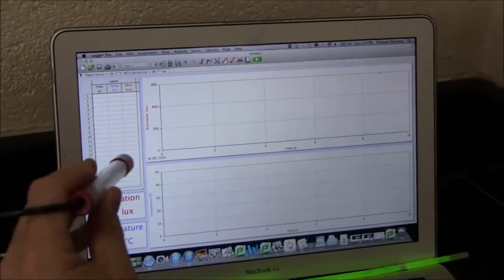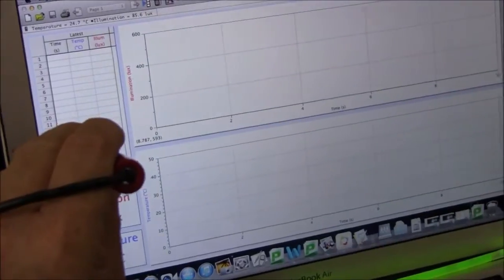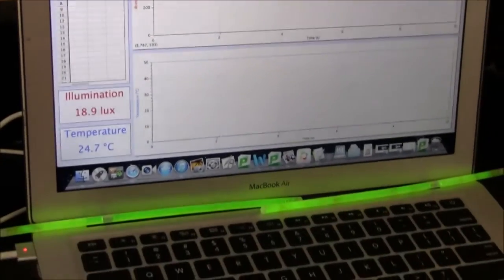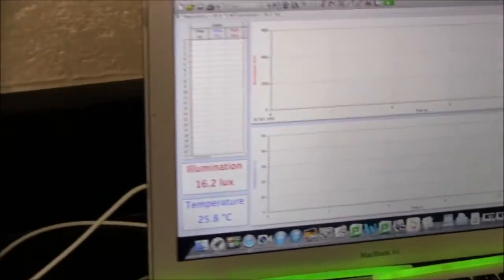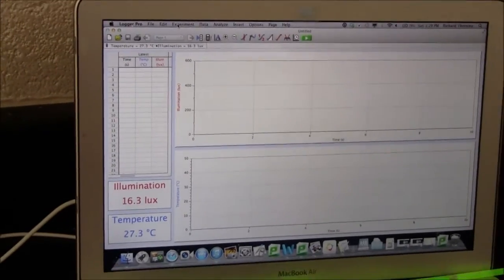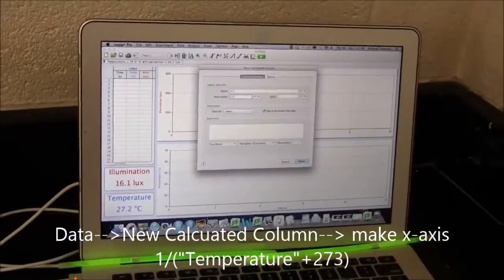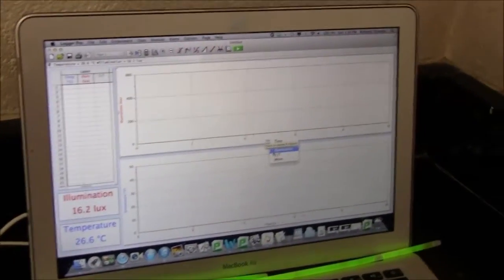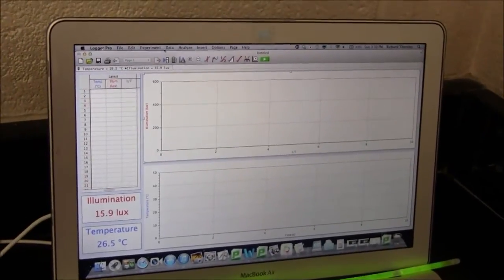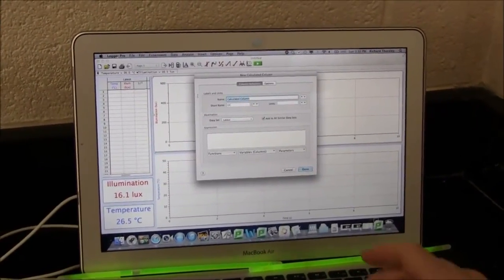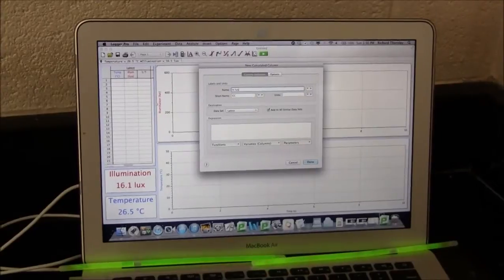So let's test the light probe. Yep that seems to work in response to light. I'm going to stick this in my armpit. Yep that's going up so both the probes work. Now I'm going to fix up the data collection. So that's going to be on the x-axis. So I need the natural log of the light coming in.